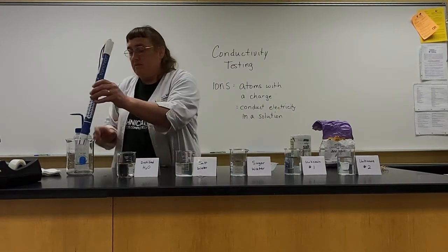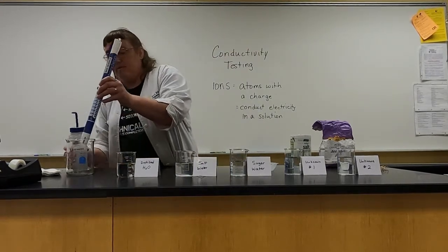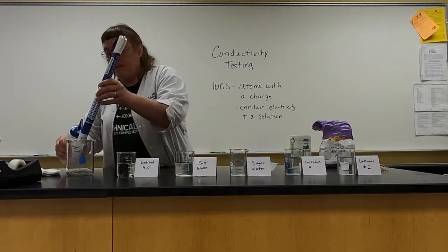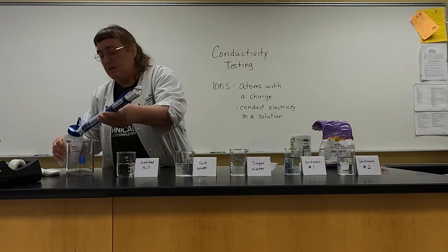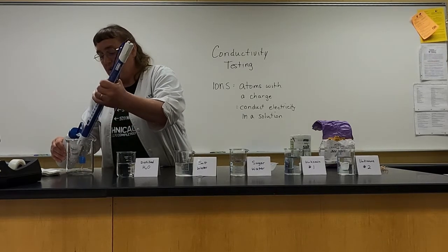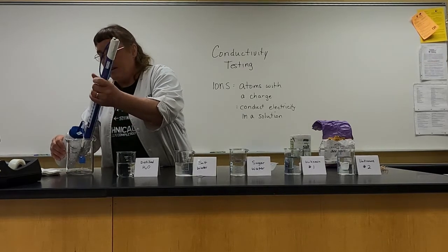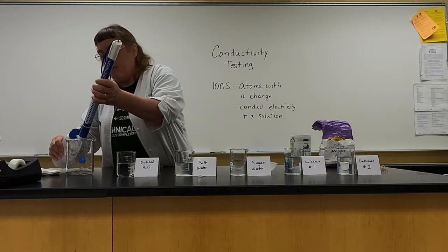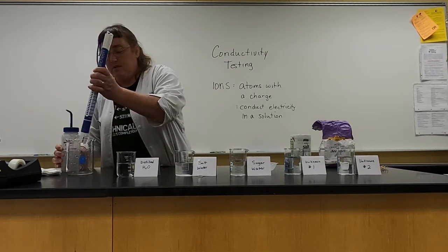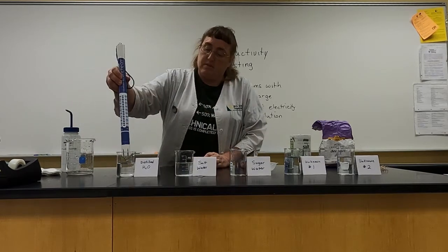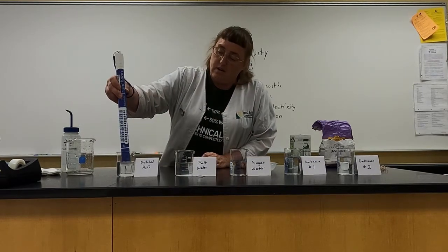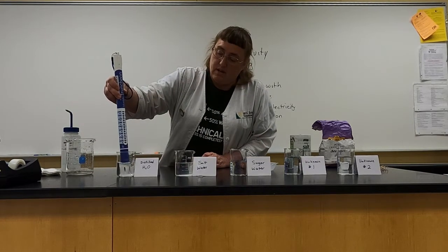Now before we go to another solution, we want to rinse off the conductivity tester and make sure the salt gets off of that before we put it in the next solution. Plain water, you should get no conductivity — that's a good way to rinse it as well.